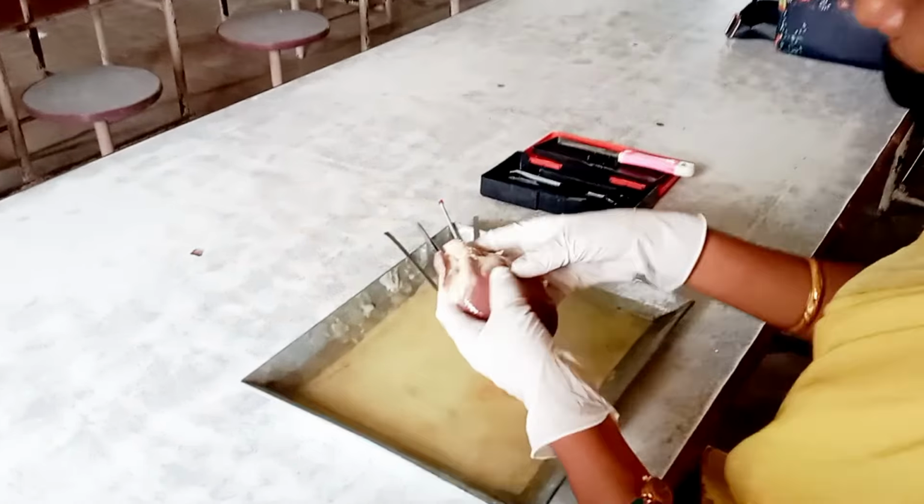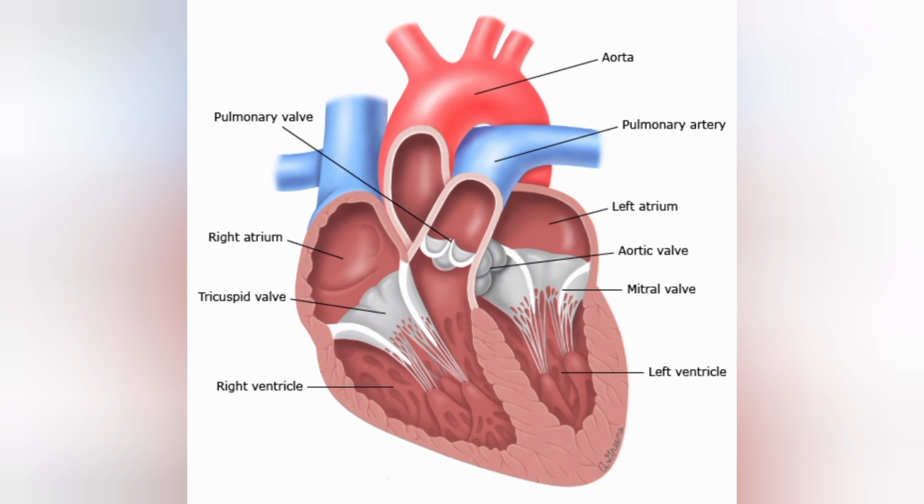Now, if you observe, another wall is separating auricles and ventricles known as the auricular-ventricular septum. Let me remind you again, septum means wall. The auricular-ventricular septum has apertures, and apertures are guarded by the tricuspid and bicuspid valve or mitral valve. These valves always allow the blood from auricles to ventricles because these are one-way valves. But when ventricles are contracted, blood cannot go up because valves do not allow the blood upwards, that is backwards.